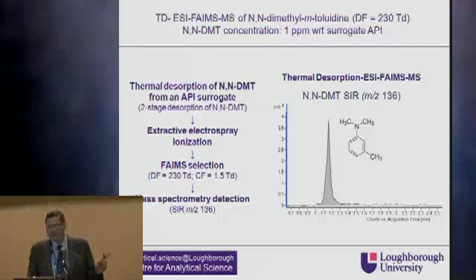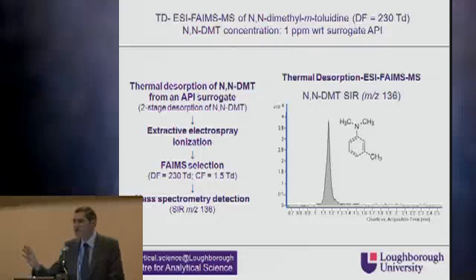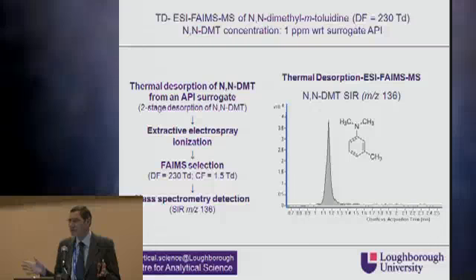That's interesting, because in this case we did not see the triply charged species. Sorry, can you repeat the question? The question was, in the bradykinin, do we see a triply charged ion as well as the doubly and singly charged ions? There seems to be some question about whether that's transmitted effectively in ion mobility.